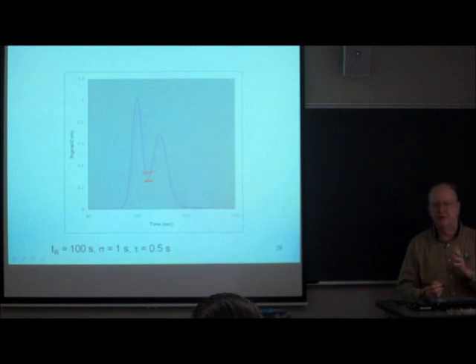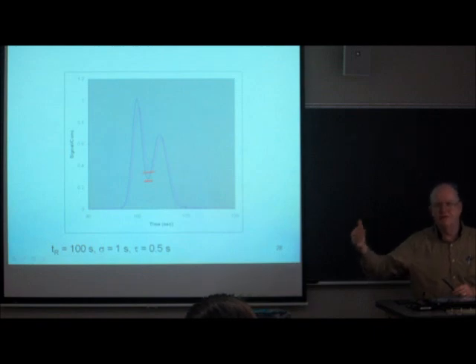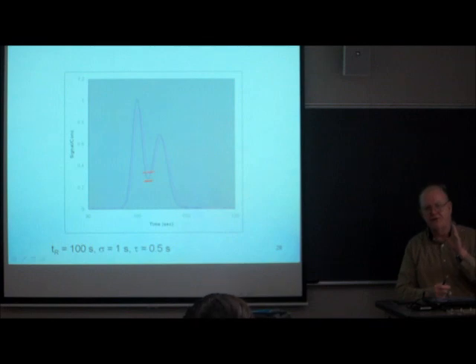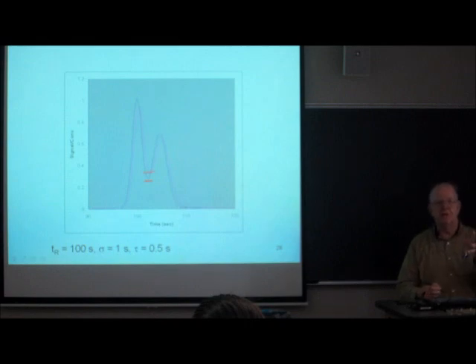This is just a fundamental fact of life. Whatever you do to get more signal has an influence on your resolving power. So you want to set it at some optimum level. There is no one number that sets the optimum level. It all depends upon the sigma of the peak.